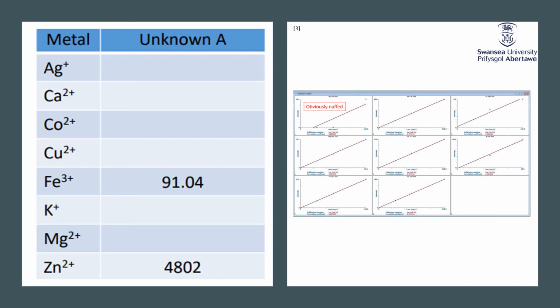As we can see for zinc as well, the points do not align as much and it does not start quite at 0 as it does with iron 3 plus. For magnesium, it could have not shown up due to maybe the concentration of the precipitate form being low. As we can see from earlier, the concentration of it was not very high or as high as in different samples that showed precipitates.